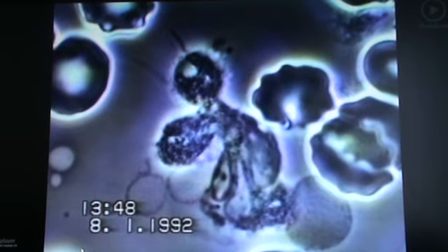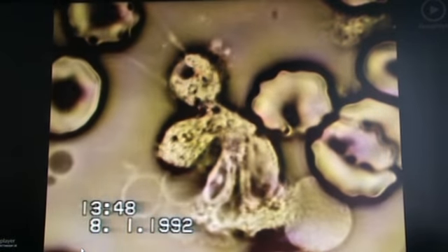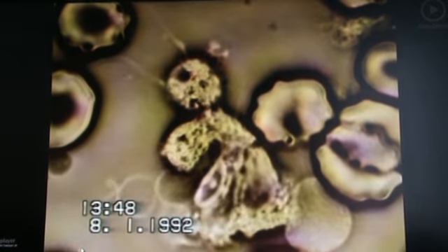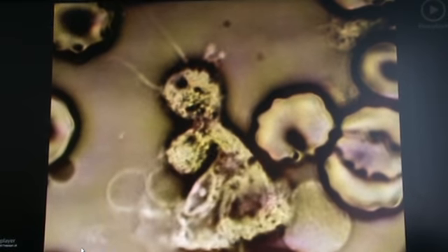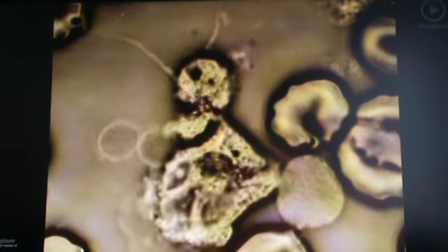White blood cells have the ability of amoeboid locomotion using pseudofeet, the so-called pseudopodium. This allows them to engulf foreign bodies and bacteria into themselves and neutralize them. Here, you can see exactly how this phagocyte moves.